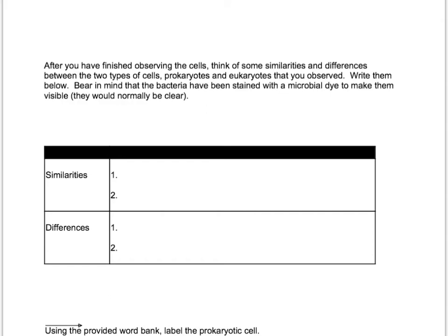Hey guys, when looking at the last lab that we did, the prokaryotic versus eukaryotic lab, this was the one where you got the prepared slide and you worked on the prepared slide on your own microscope. And on the right side of the classroom, there was a bunch of living eukaryotic cells, protista, and on the left side of the classroom, there was some cultures of bacteria and the prokaryotic cells.